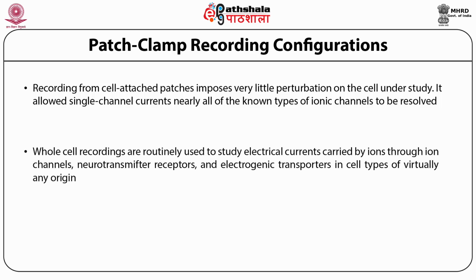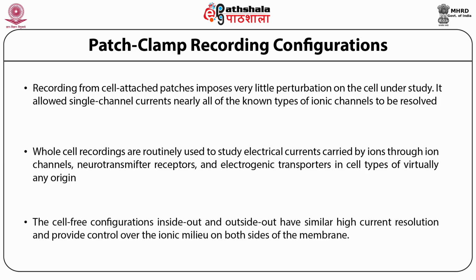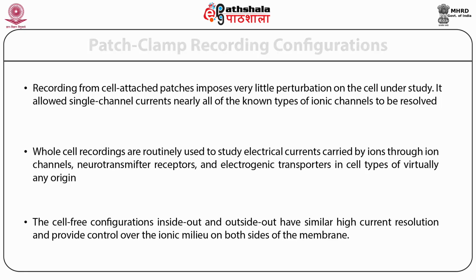Whole cell recordings are routinely used to study electrical currents carried by ions through ion channels, neurotransmitter receptors, and electrogenic transporters in cell types of virtually any type. The cell-free configurations, inside out and outside out, have similar high current resolution and provide control over the ionic milieu on both sides of the membrane.